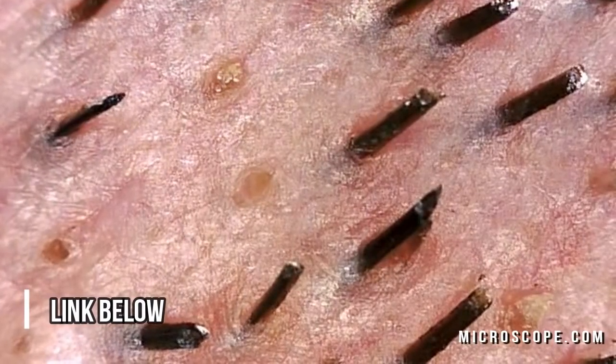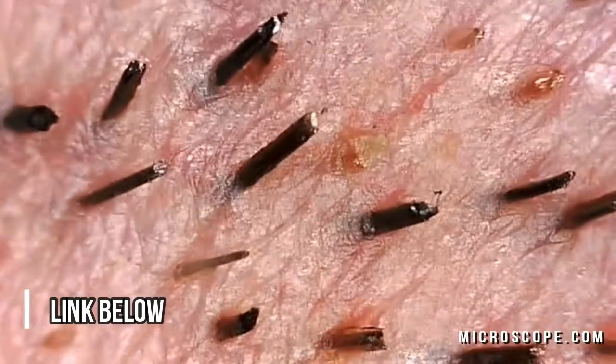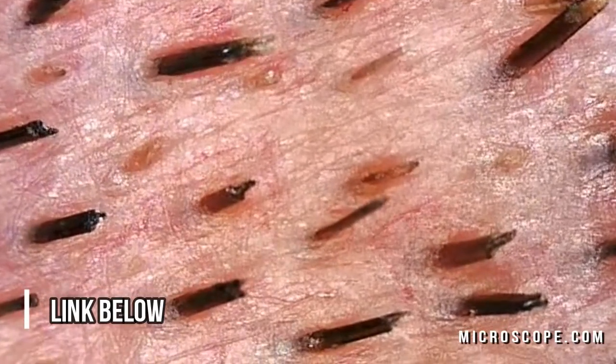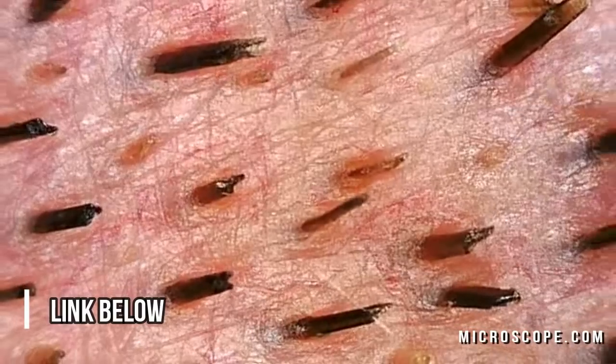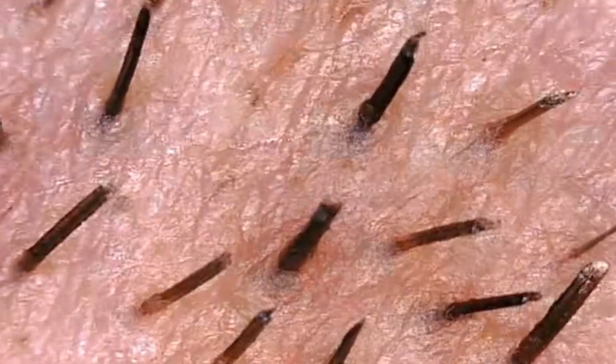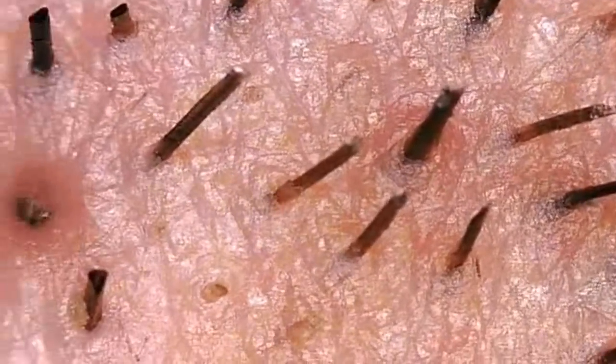Now let's look at the actual microscope footage from the camera itself. Again, this is about 100 times magnification. What's fascinating is the heat from the light bulb in the camera actually causes your skin to glisten a little bit, and you can see that. In some cases, if you watch real closely, you can see sweat come out of skin, which is fascinating to see.